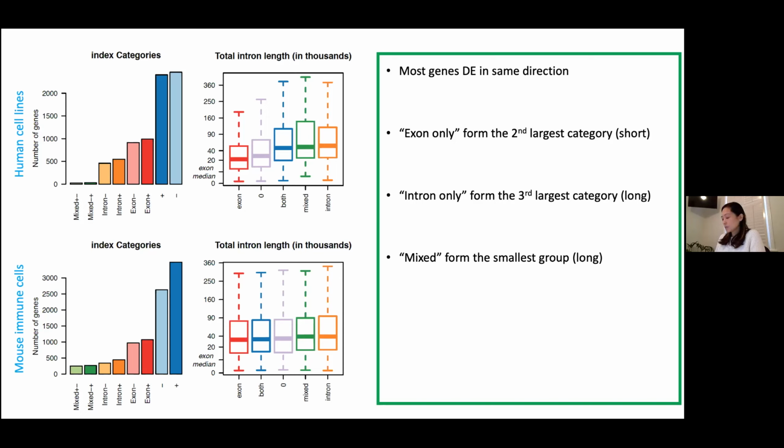So these are the results, but let's have a go at interpreting what this might mean biologically. So looking at those genes that are in the plus minus groups, it looks like transcriptional changes are similar for both the intron and exon count sets, which would make sense if we expect exon counts to represent mature mRNAs as well as pre-mRNAs, given that we're saying that the intron counts represent pre-mRNAs. So there is that overlap and that could be expected.